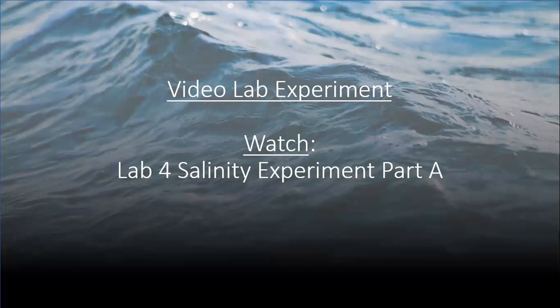Next, pause the video and watch the video lab experiment posted in your online lab section entitled Lab 4 Salinity Experiment Part A.